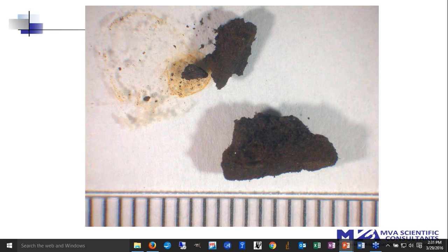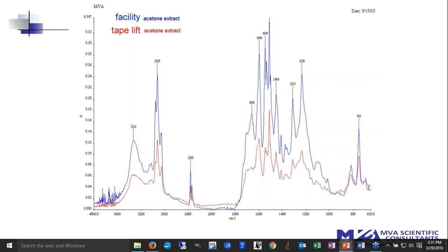We got a reference sample. We noticed that the resin holding all this stuff together was acetone soluble. So we're able to do an extraction, compare the 2 resins, the reference and the unknown from the cars, and show that it was a phenolic resin. The phenolic resin, in combination with all the other materials, pointed to an industry that did aluminum casting, so that the vapors from the casting process, when they poured the molten aluminum into these sand molds that were coated with the phenolic resin release agent, was condensing outside of the air handling system and dropping onto cars in the parking lot.